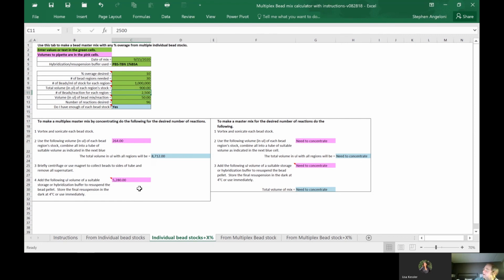as well as being accurate compared to trying to do this by just having a standard dilution, where some people say all their beads are at 50 beads per microliter. And they just keep combining them, whether they've got a 5-plex or a 30-plex, and you can see how that would tremendously cause a dilution of your beads, because you wouldn't take it through a concentration step if you use that protocol as written in the cookbook.